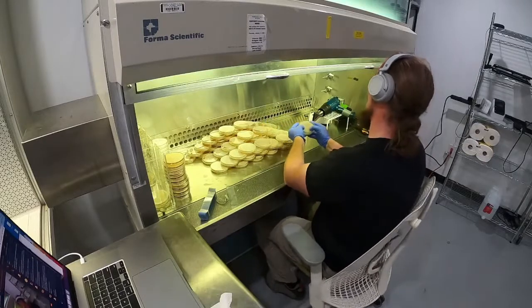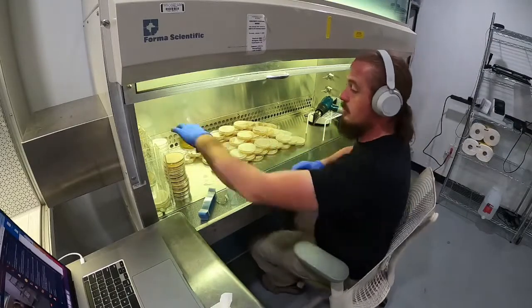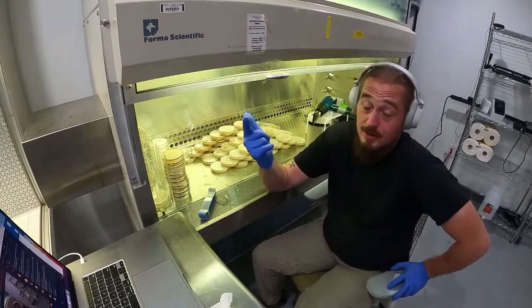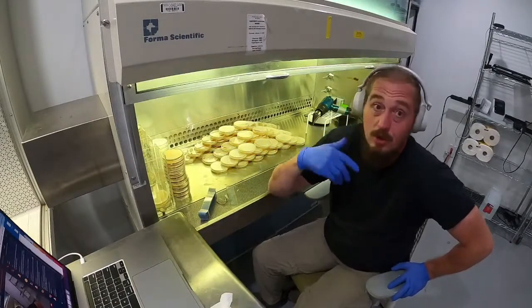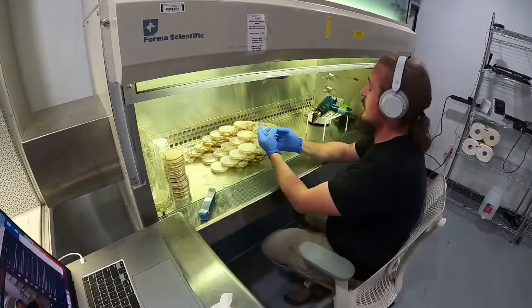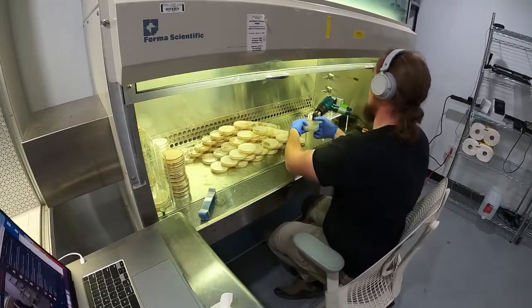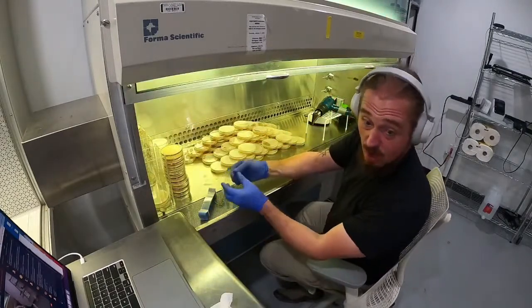Now you're probably saying, hey, wait a minute. If grain is sterile and my spore syringe is sterile, then why would I have to worry about bacteria and contamination? It's because it's not sterile. You've exposed it to open air, you've injected a bunch of water into it, you've injected a bunch of inert material that could or could not be contaminated. The list goes on. Filter patches allow gas transfer. And so what ends up happening is, say you inject 10 cc's of spore solution into a grain bag, you're going to have what's called the stall. The stall is where you're waiting for those spores to germinate and then take off and start mycelating, right?